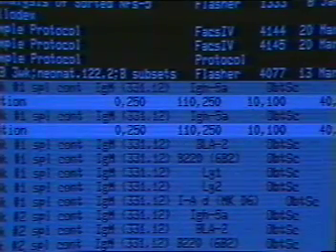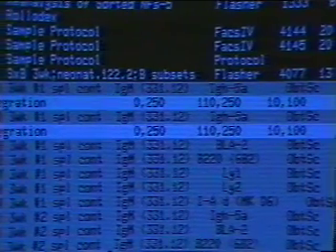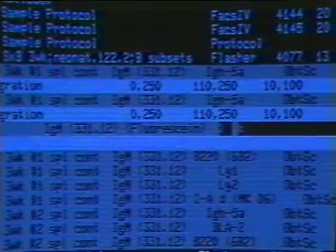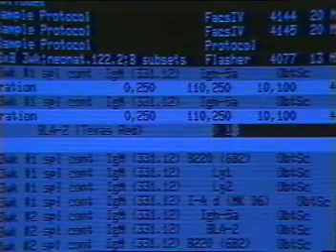On the new line, the gating boundaries for each parameter are listed below the corresponding reagent or sensor heading on the card. The left side of the line is labeled to indicate the type of analysis requested. To review, position the cursor and press Insert. For each sensor prompt, use the main keyboard to enter gating boundaries and then press Return to move on to the next prompt.